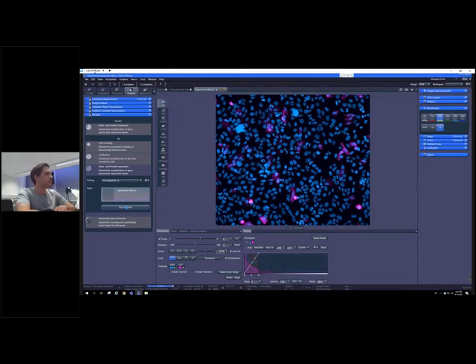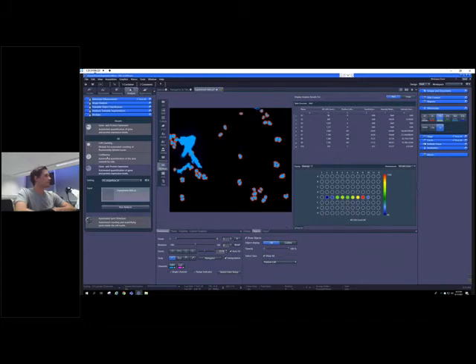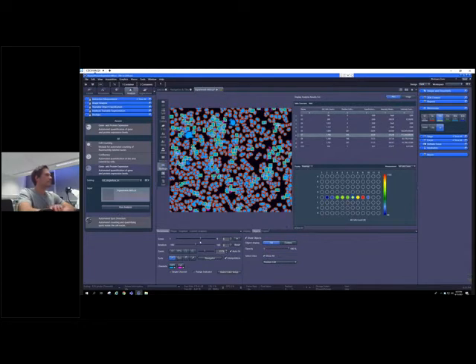This is one thing that you can directly do, or as I started here now, we can directly analyze gene and protein expression. This would make a lot of sense with this type of cells, because here we had a transfection regime with different concentrations, and we would be interested in getting the readout as a graphical representation of our transfection efficiency.